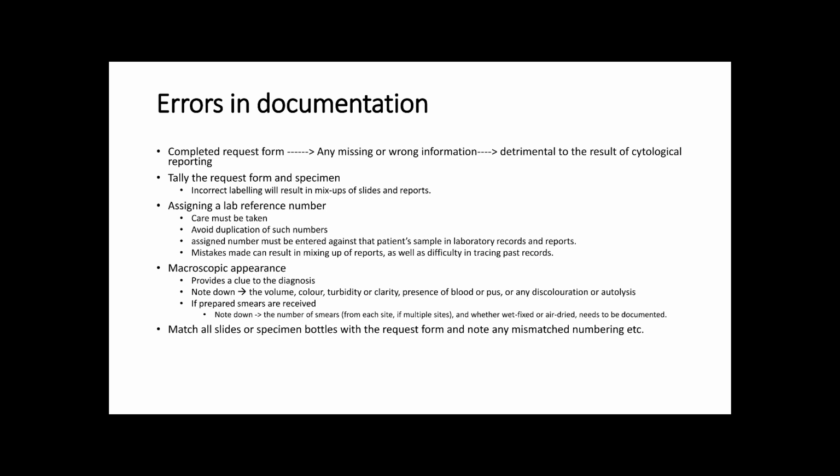Right, next one, care must be taken when assigning a laboratory number to avoid duplication of such numbers, and the assigned number must be entered against the patient sample in the laboratory record and the reports. Mistakes made can result in mix-up of reports as well as difficulties in tracking or raising past records.